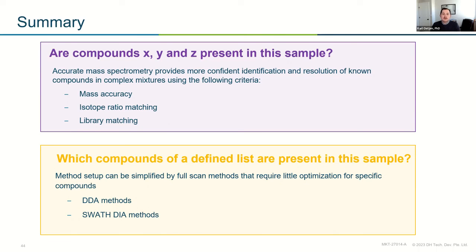I have this unknown supplement. I want to see if these drugs are present, et cetera. And a QTOF does a great job of that, right? Because we can acquire MS data quickly without designating what parent ion, whether you're using data independent or data dependent acquisition, depending on what you're trying to accomplish. You can get at, are these compounds actually present in my sample?